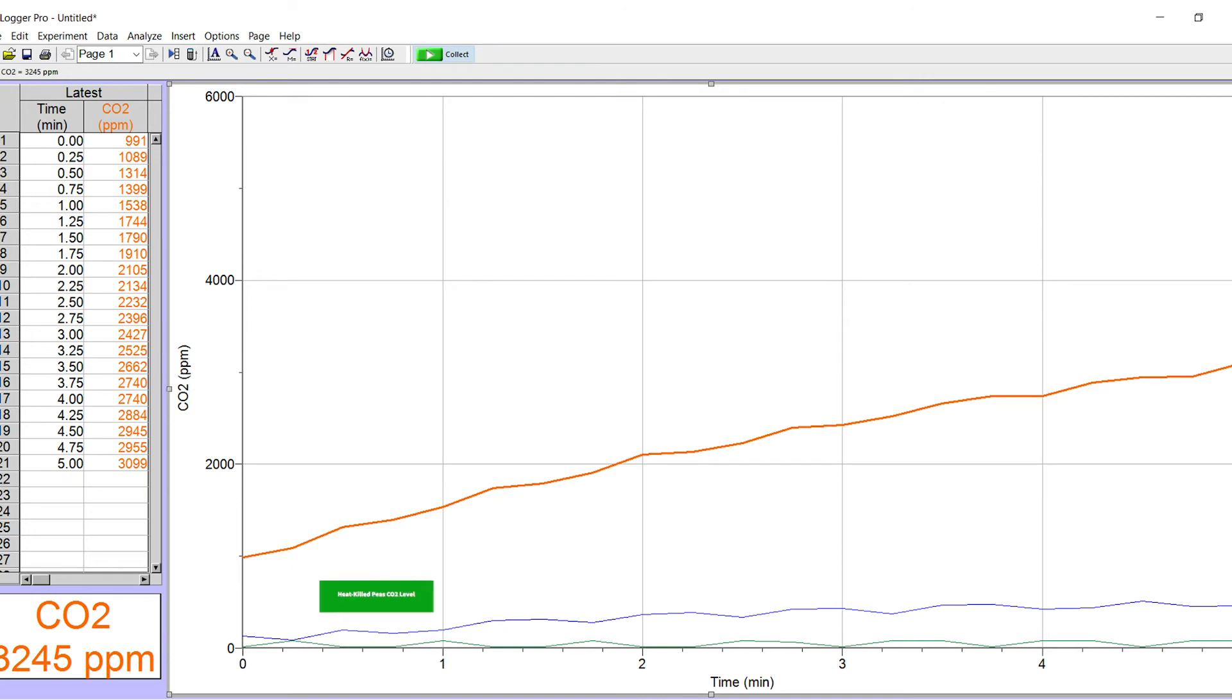We see from the final graph that our heat killed peas did not produce any CO2, only measured what was atmospheric and already within the flask. The cold germinated peas did produce low levels of CO2. Cellular respiration was occurring but at a greatly reduced rate due to the environmental factor. And then our room temperature peas not only were producing much higher levels of CO2 but those levels of CO2 increased over time. We measured for five minutes and saw that we had a steady increase of CO2 levels within the flask due to cellular respiration occurring within the germinated peas.